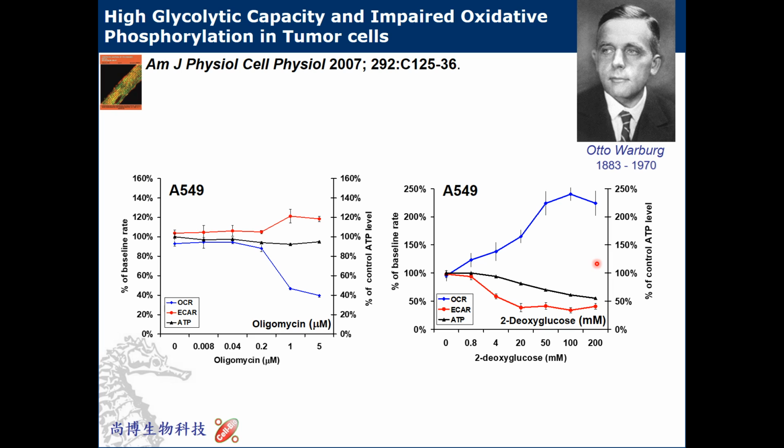It is very weird because we know mitochondria produce ATP much more efficiently than glycolysis. How come it feeds back so much but could not satisfy the lack of glycolysis? So it definitely must be that A549, this lung cancer cell line, is very reliant on glycolysis, and the mitochondria should have no function or be dysfunctional, so even though they feed back very much, they could not satisfy the lack of glycolysis. So we call it the Warburg effect.